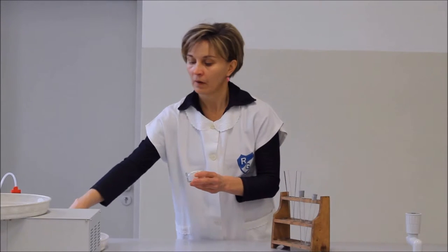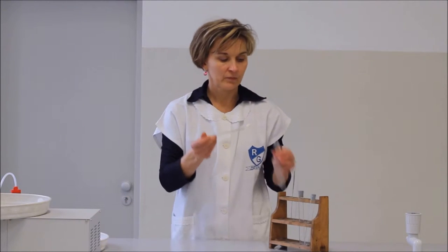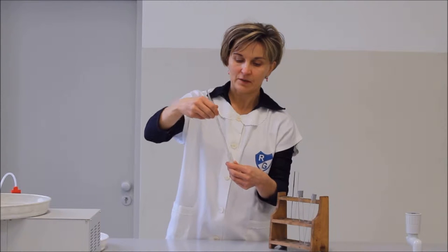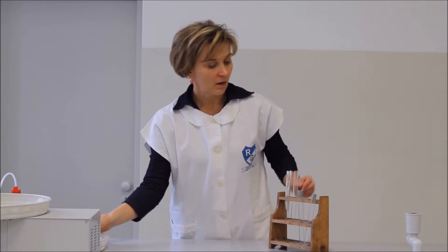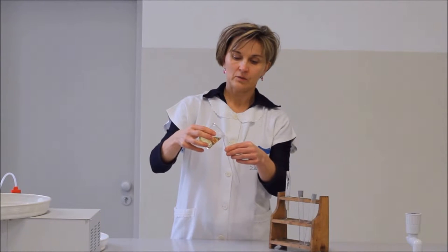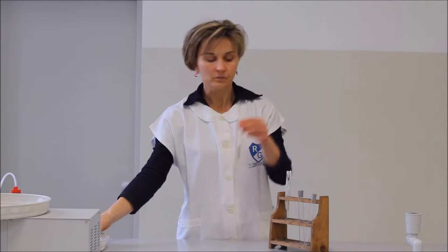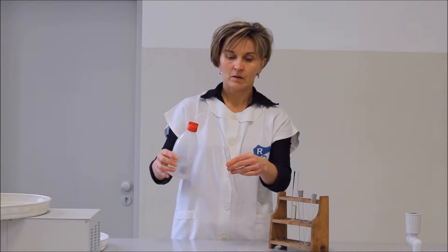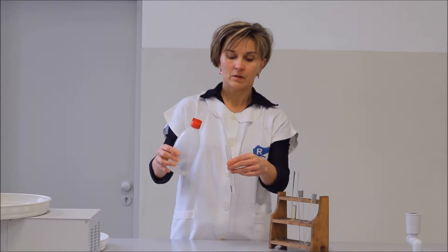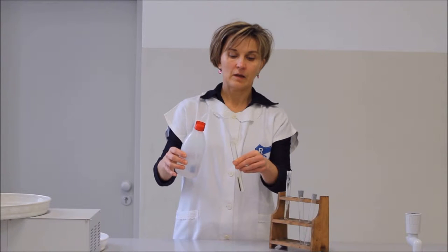Tehát két kémcsőben teszünk disznózsírt. A kémcső aljában próbáljuk elhelyezni. A másik kémcsőben étolajat töltünk. Majd pedig desztillált vízben próbáljuk feloldani a zsírt, illetve az étolajat.